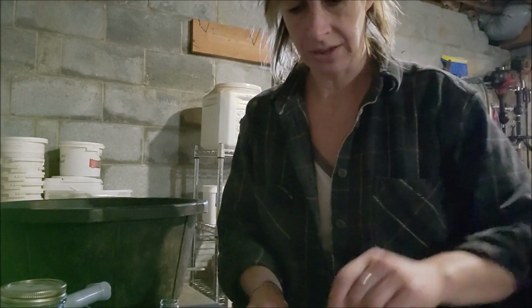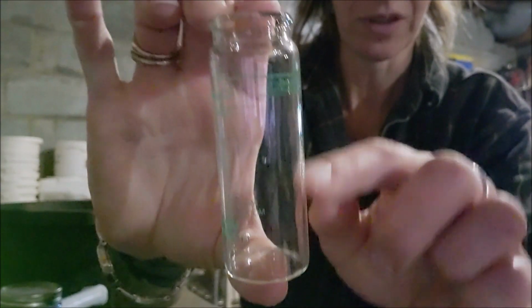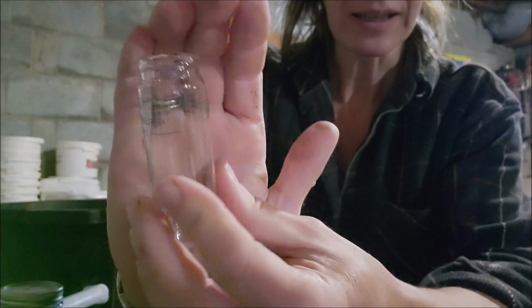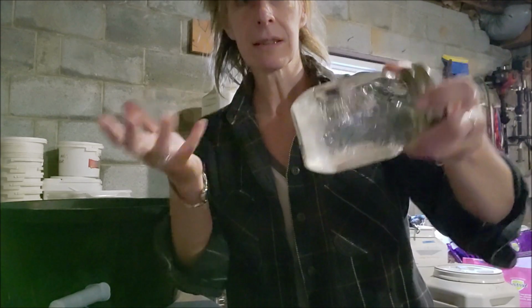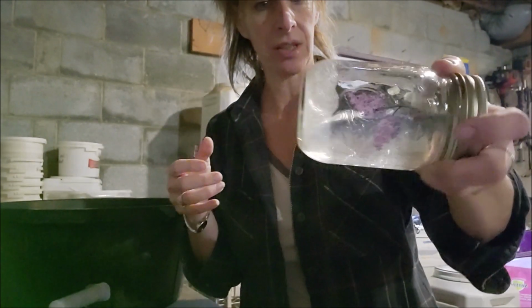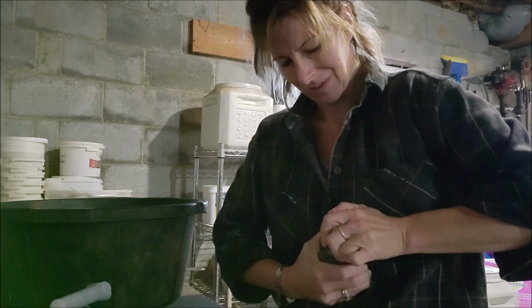All right, so the next thing you want to do, now that you've got it all mixed, is have one of these things. They've got gauges on them, and you fill up your solution and then you fill up the fecal in here. It's really hard to see, but I think that one's sheep, and on the other side is equine. You have some fecal solution, which is just overly salted water, and you can see this has some salt here, which is undissolved, which means this is a flotation, this is fecal solution. It's very good.